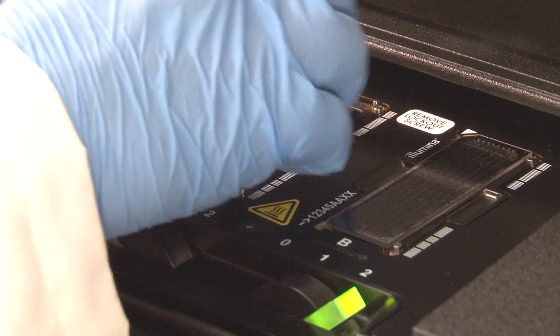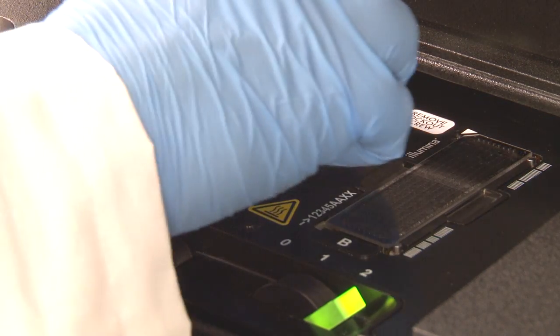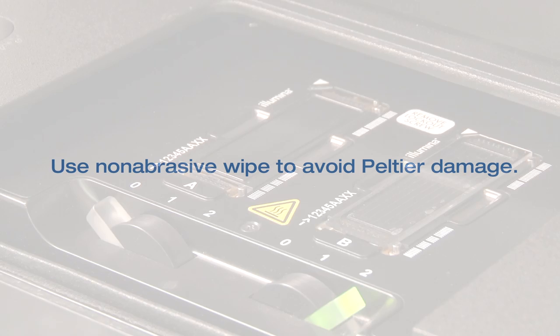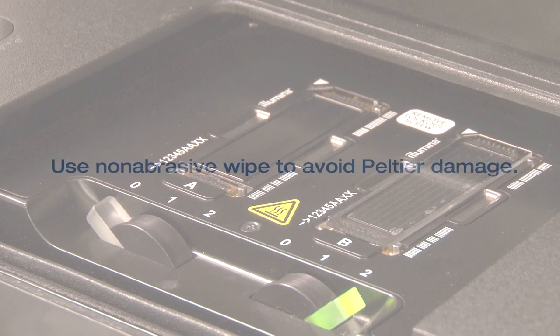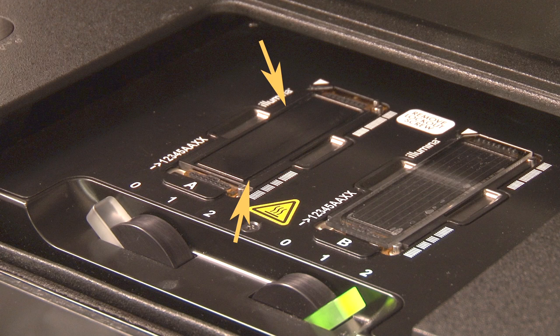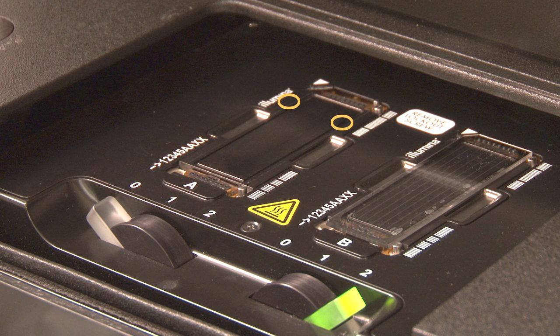It is important to clean the stage before each run with ethanol or isopropyl alcohol. Be sure to use a non-abrasive wipe, as the Peltier plates are optically flat and must not be chipped or damaged. Also, inspect the ridges around the flow cell and the vacuum holes to ensure that they are free of any debris.